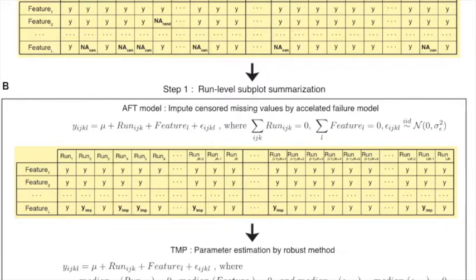And so the last thing we will do is use Tukey median polish, which is a robust summarization of this two-way table to have one number per protein per run. I'm hand-waving here a little bit. Tukey median polish is essentially a robust alternative of two-way analysis of variance. If you have done any work with genomic data sets, you're familiar with, what was the name of the normalization? The normalization for Affymetrix microarrays, they also use Tukey median polish to summarize multiple probes in one number. I forgot the name of the normalization.